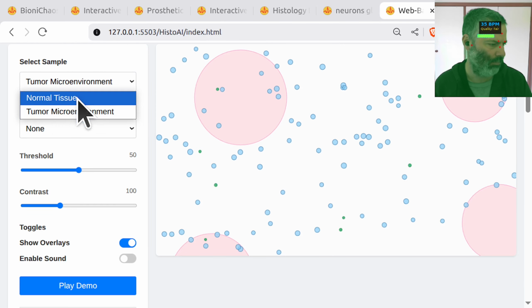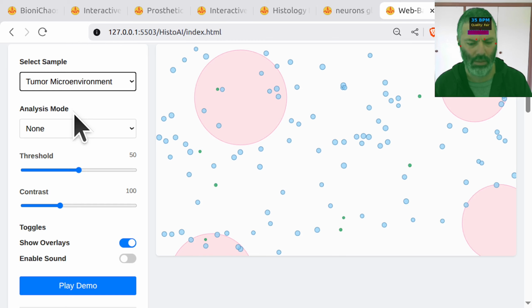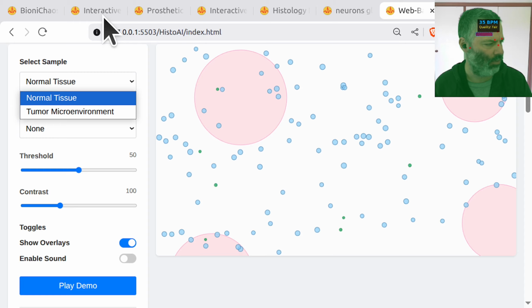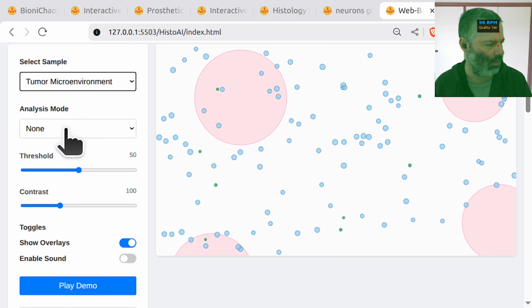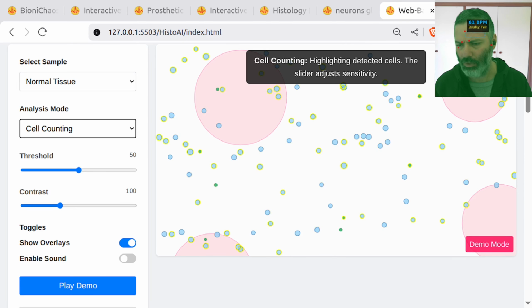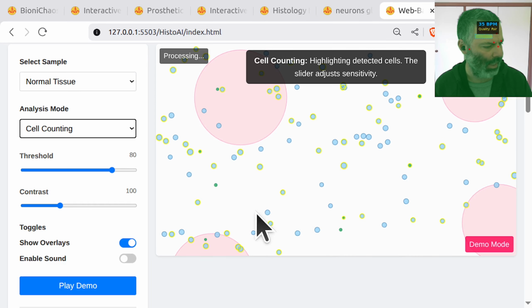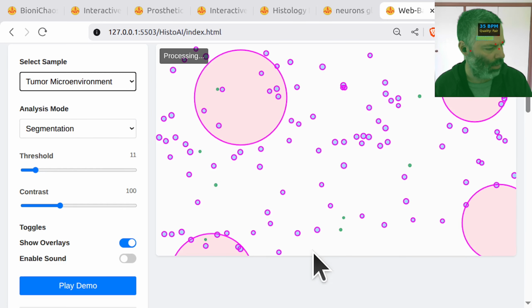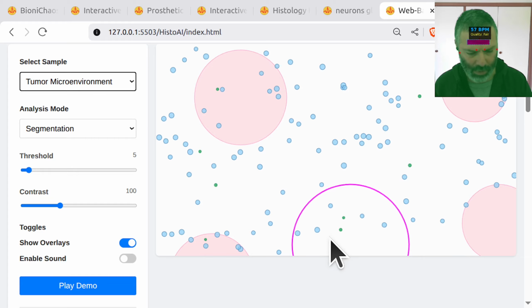There's meant to be a tumor. There's something, it stuffed up the code or something. Something is wrong. It removed the tumor or something. It's meant to be there. It's still detecting it.